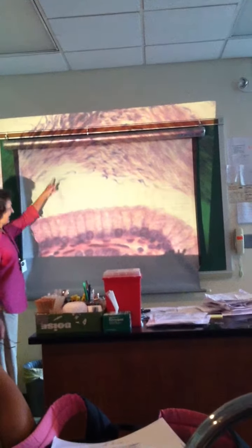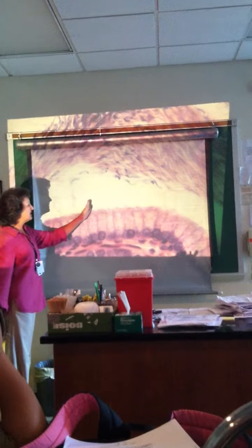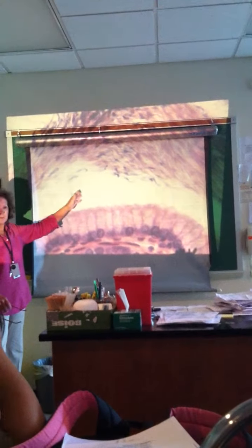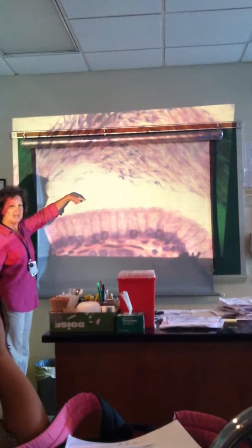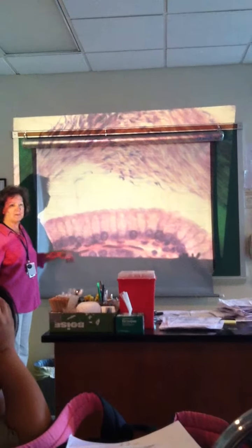This is the prettiest you'll ever get. Look at the cell. Long cilia this time. Sometimes cilia are real long and sparse. This is kind of sparse. Other times they're shorter and thicker. But yeah, in reproductive tubes they tend to be sparse but longer. And see the nuclei? So it is ciliated, simple, columnar epithelium.